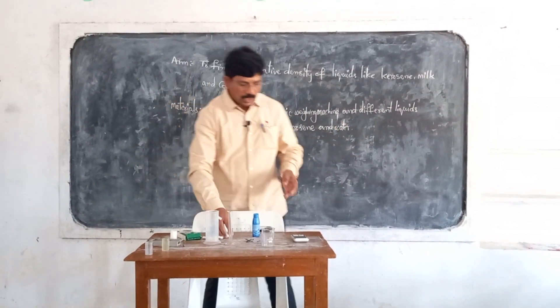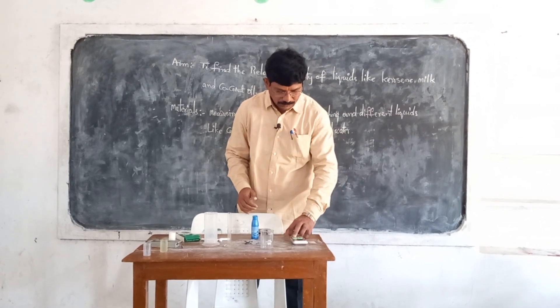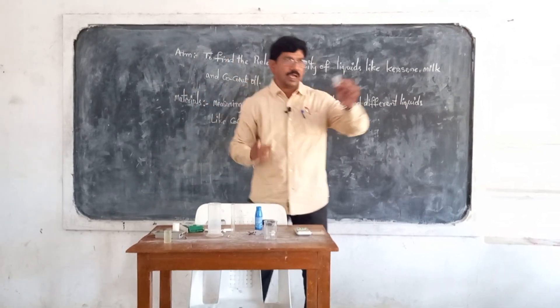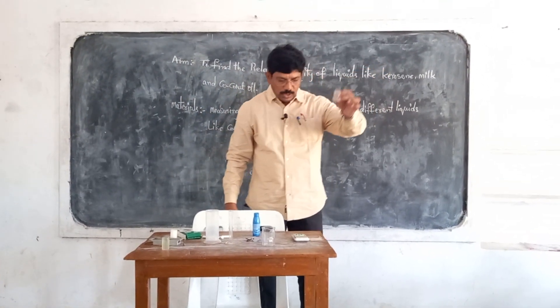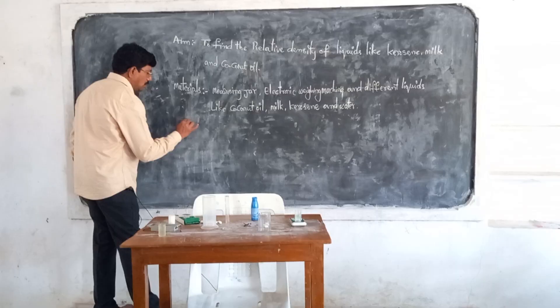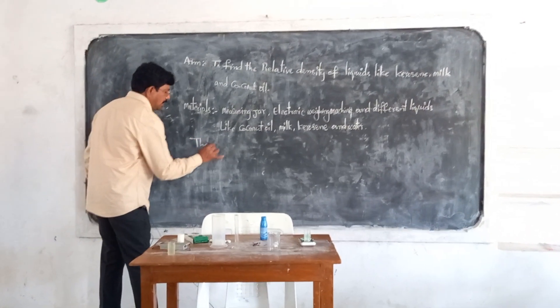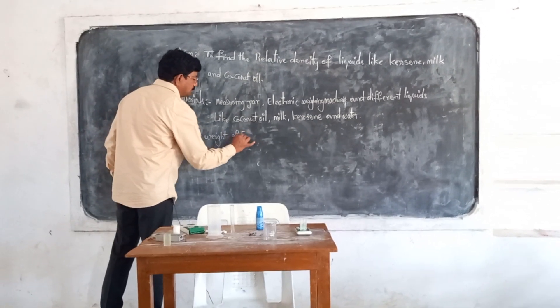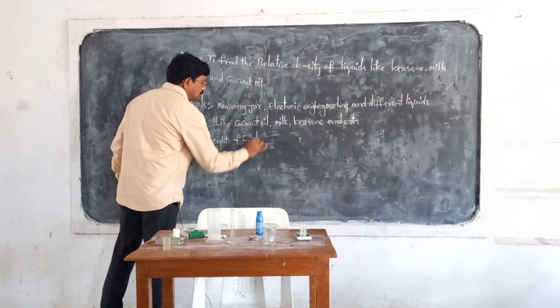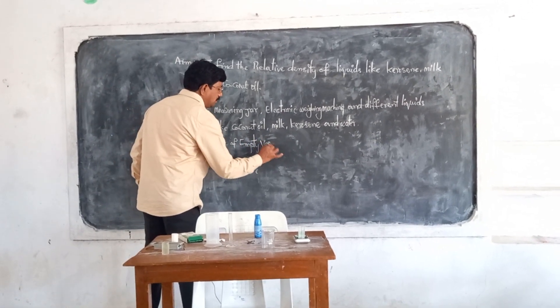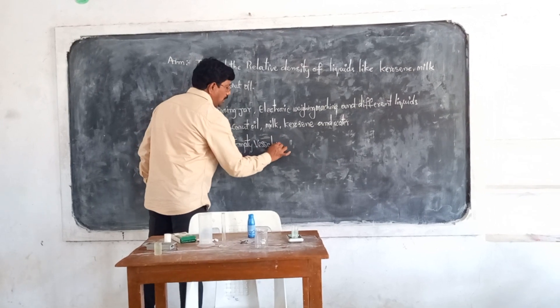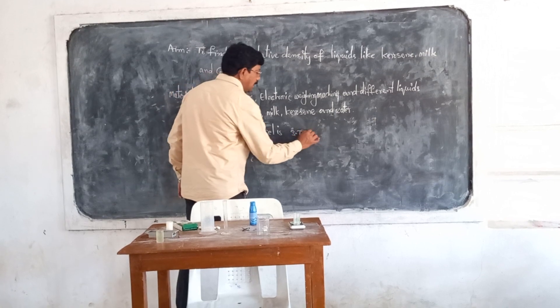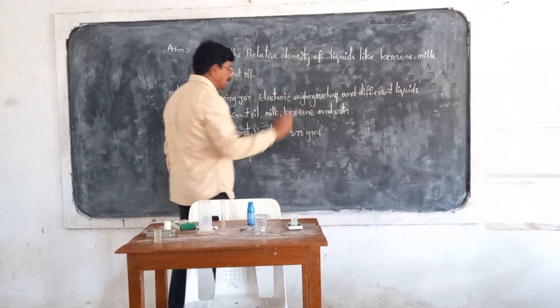Before starting the experiment, I have taken an empty vessel and I am finding the weight of the empty vessel. The weight of the empty vessel is 3.73 grams.